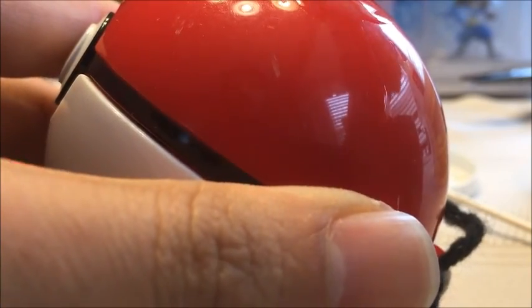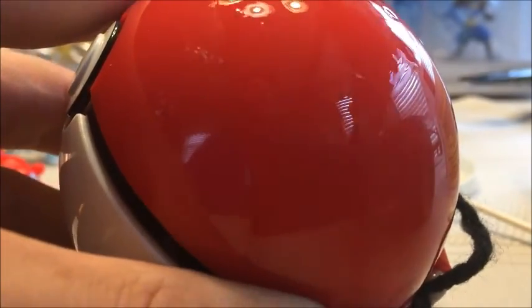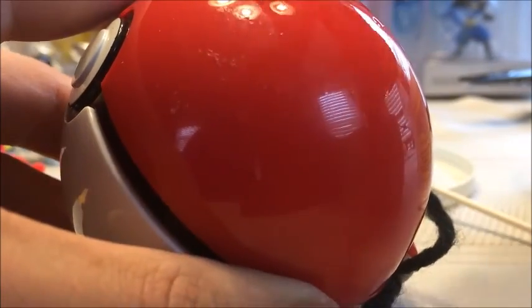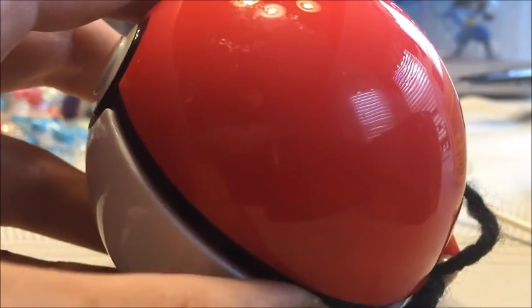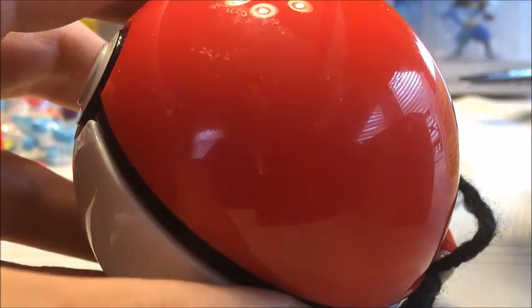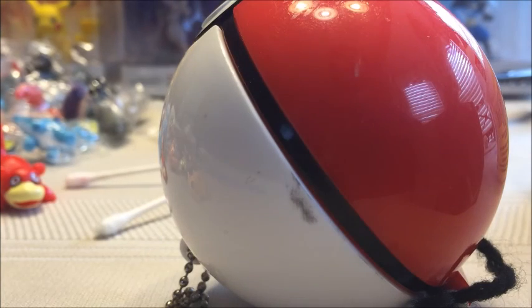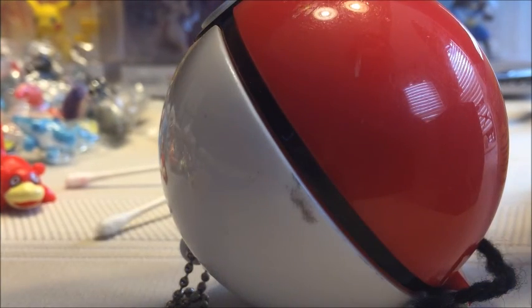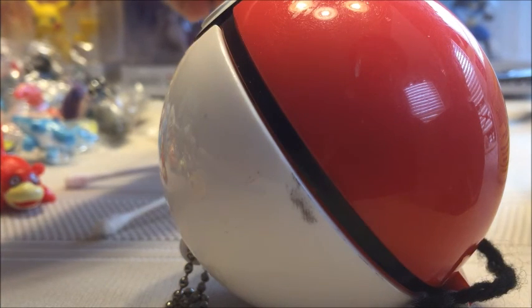Now we have the Jack's Pacific brand Pokéball. We'll use the other side of this Q-tip to test this one. I can't let my hands get on the Q-tip — that's why I have to wear this glove.